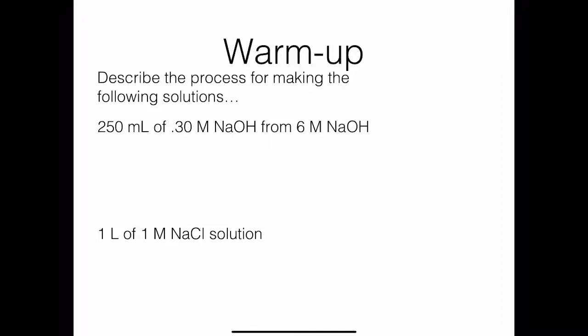For the warm-up today, we need to look at the process for making solutions. So we've talked about this from a mathematical perspective and how to do the calculations, which we will look at in a minute. But we also need to talk about the actual process for making these. So what glassware is included, what that looks like in terms of the steps that you're going to take to make these different solutions. And we'll look at the first one.